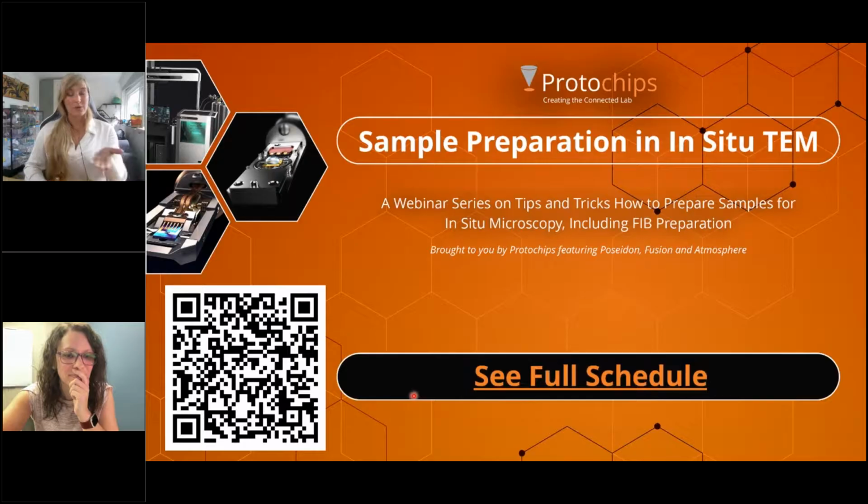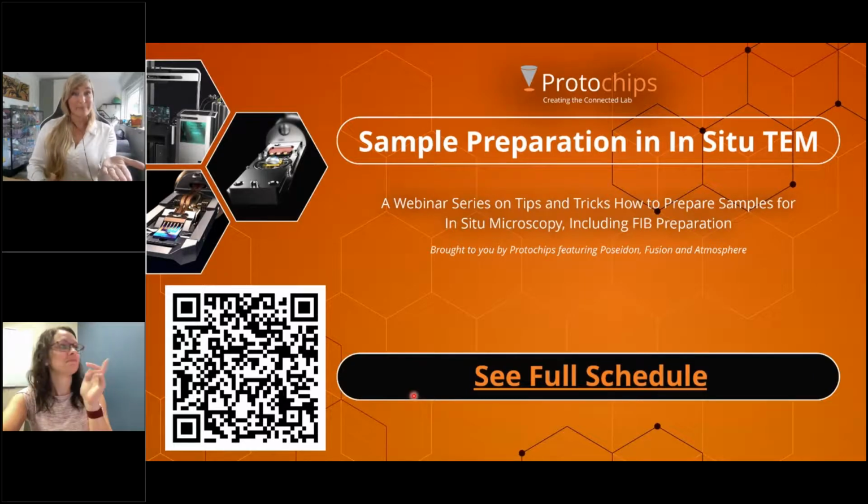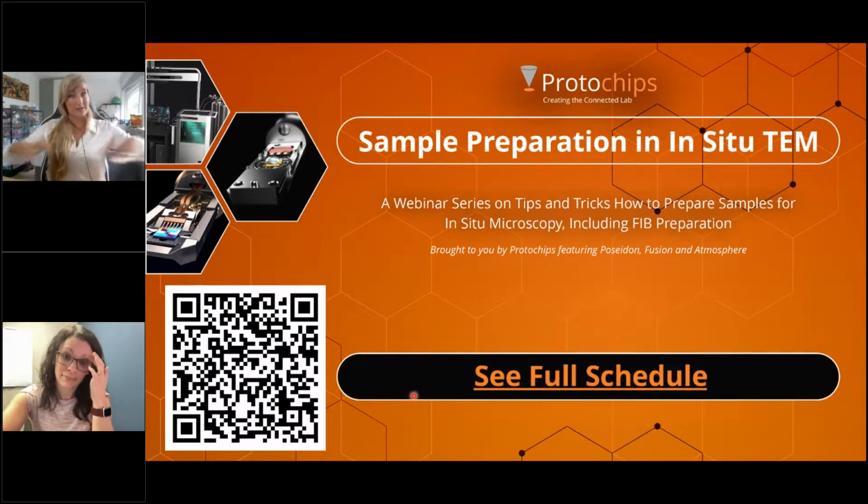If you want to try, you can take one of the blank E-chips and put it in the plasma cleaner, because it also depends on the strength. You can drop cast a little bit of liquid, and if it nicely spreads, then you know you've done a good job. Otherwise, put the blank chip in again and try a different gas, a different strength, or a different length of time.